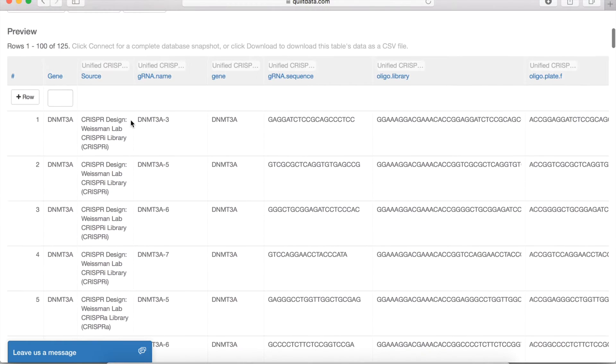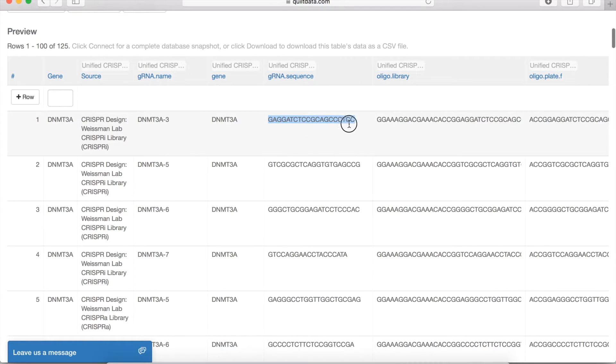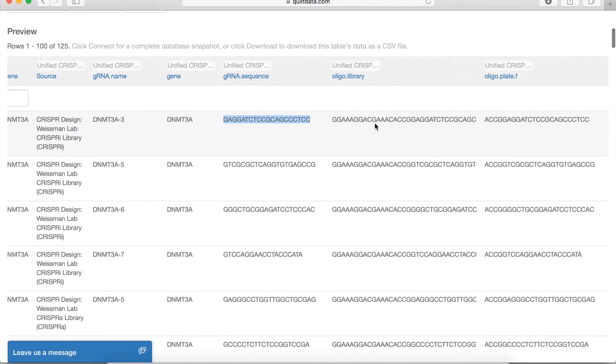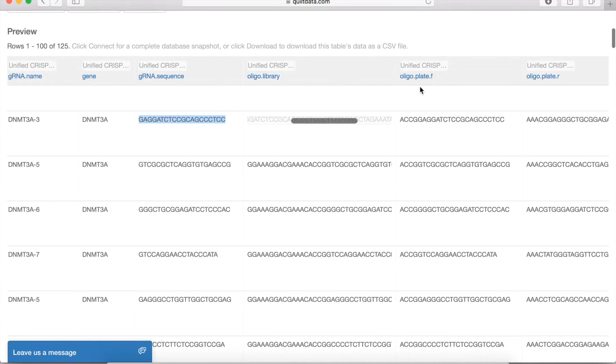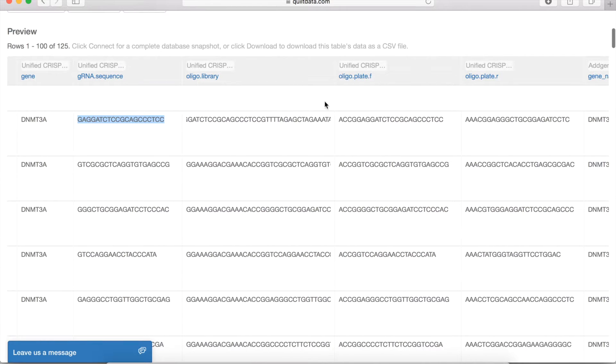And then the rest of the fields here, you can see that we're returning you the 20mer guide RNA sequence, the actual design. And then we've input various oligos that can be useful for cloning once you want to actually start your experiment.